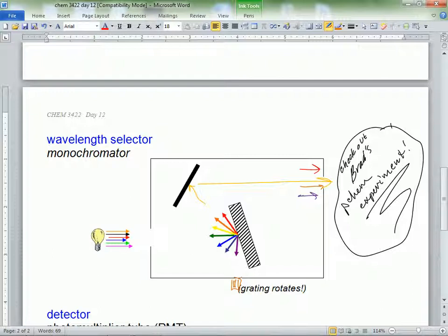Okay, but we can take a look at the setup here. You see that inside this box, there's the light source, right? It's going to be one of those discharge lamps, kind of like we were talking about. But there's your slit width, and then you have this incoming light coming in. So the monochromator is over here, and here's a plastic doohickey hanging on the wall. See that? There's your grating that the light's on, and then the light's passing through. All we're missing in our monochromator is the other slit hanging out over here. But on the wall, he's got it all.